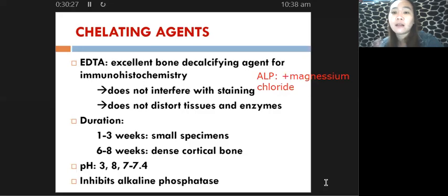Okay, so I repeat, during the early stages of decalcification, you have to change the solution every 3 days. During the final stages of decalcification, you have to change the solution every day. Okay, every day. All right.